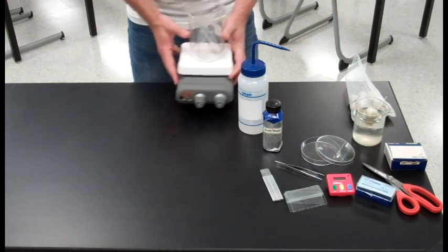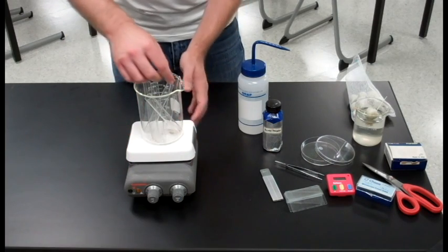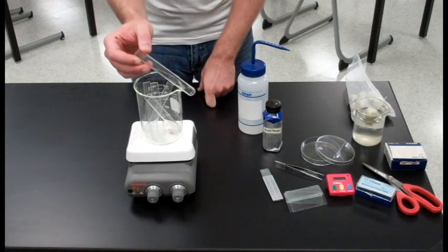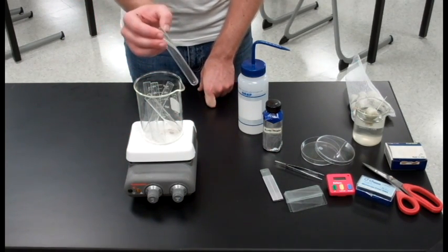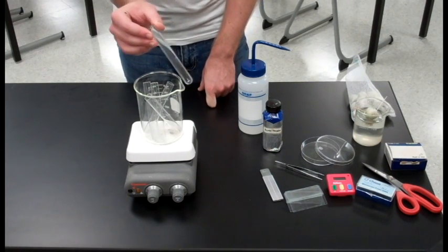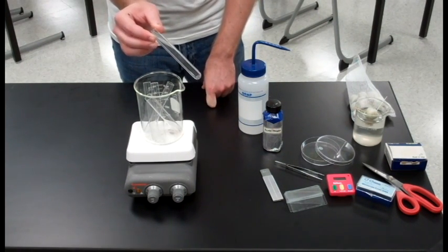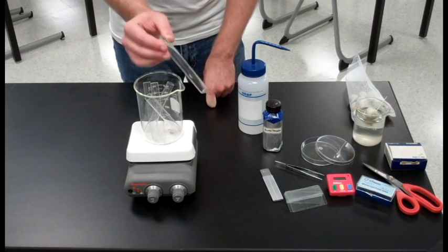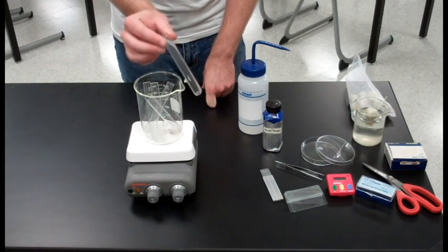The fixative setup should look something like this. Your test tubes will have the fixative solution in them. Remember fixative is nine parts 45% acetic acid to one part one molar hydrochloric acid. Mix that up and then put two to three milliliters in each test tube.